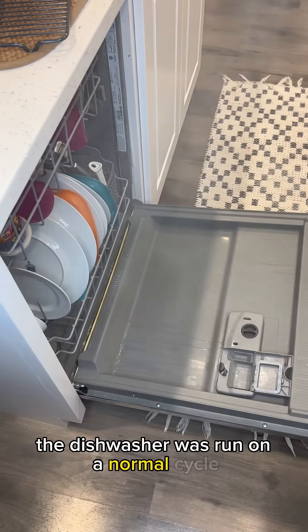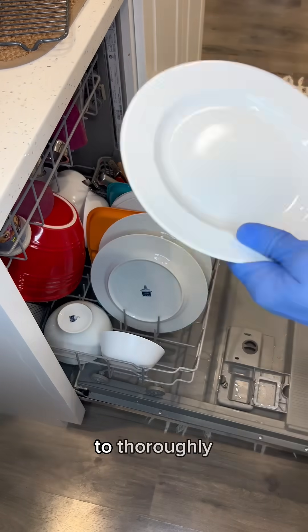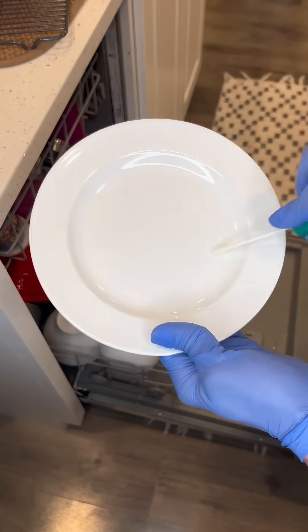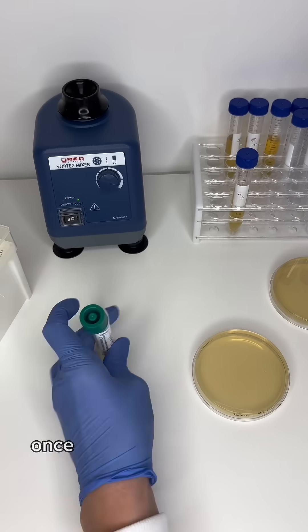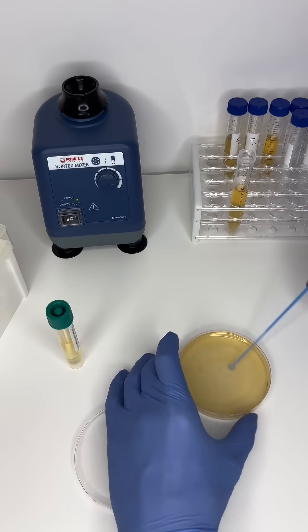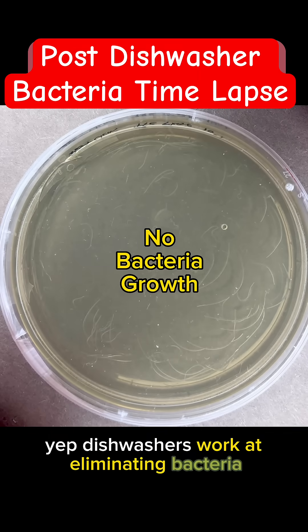The dishwasher is run on a normal cycle. Now I'm going to use a different environmental swab to thoroughly check if there's any bacteria left on the plate. Once again, let's put this on a petri dish and incubate. Yep, dishwashers work at eliminating bacteria.